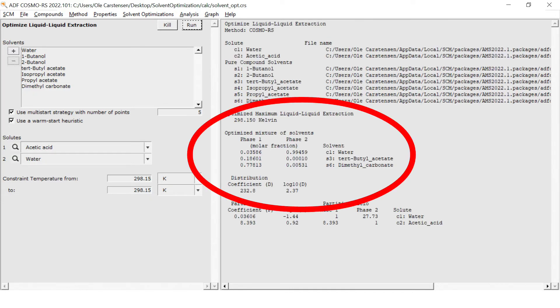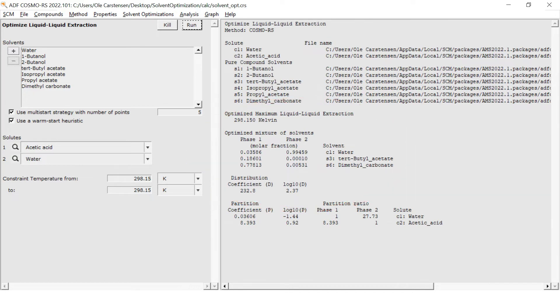The result is a combination of a mostly aqueous phase and a dimethyl carbonate-tert-butyl acetate phase as the solution.